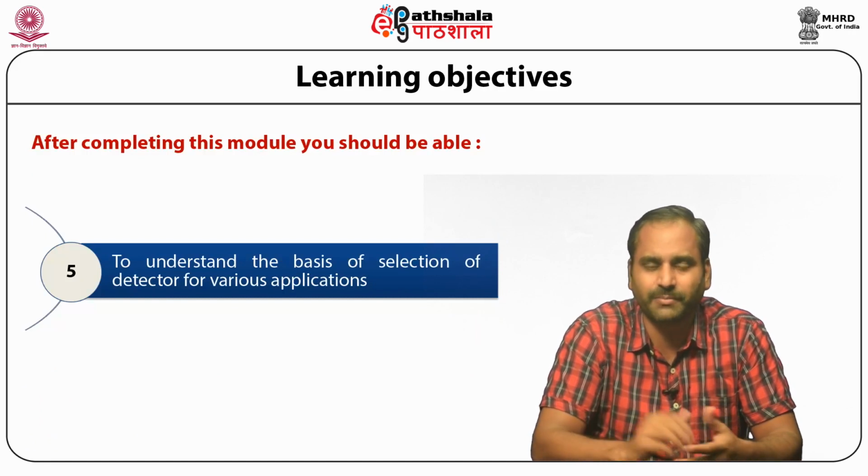for various applications. Gas chromatography is a method of choice over other chromatographic techniques due to its detection system, or the detectors. Carrier gases used in gas chromatography are transparent, due to which the background level and the interferences are quite low in gas chromatography detectors.